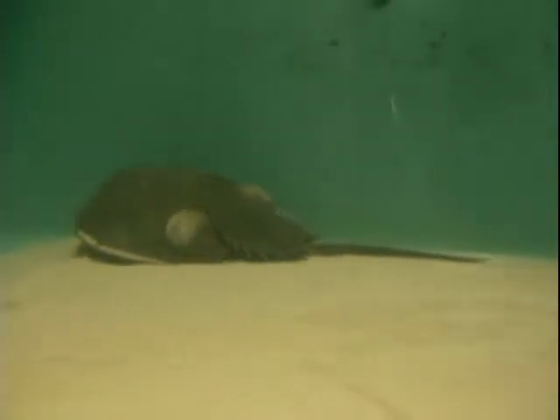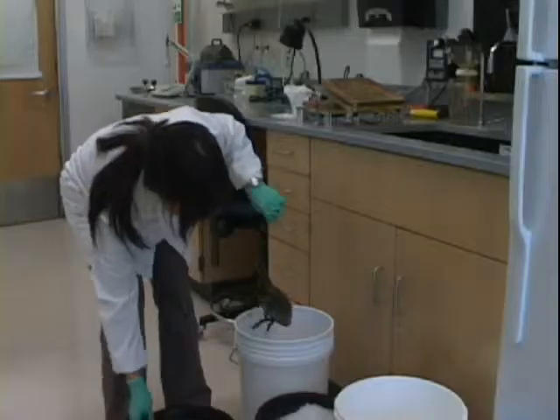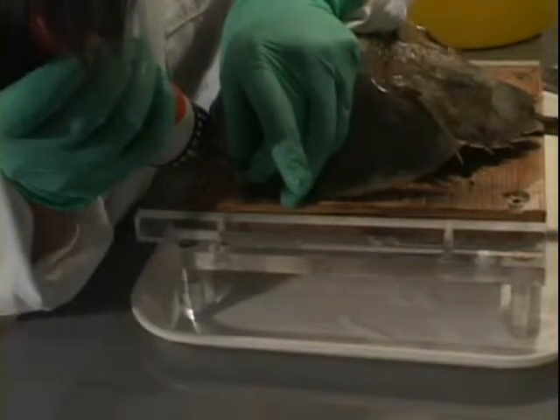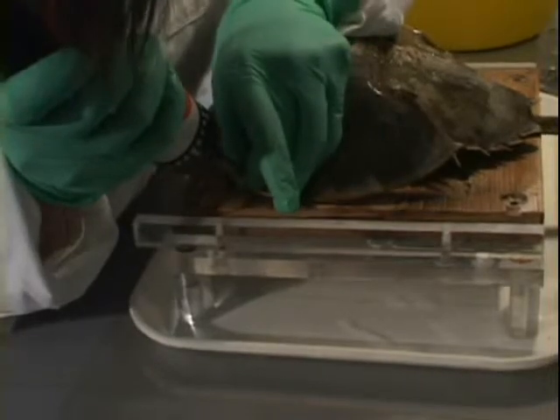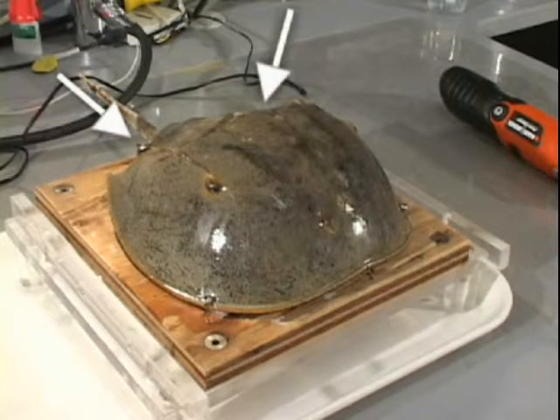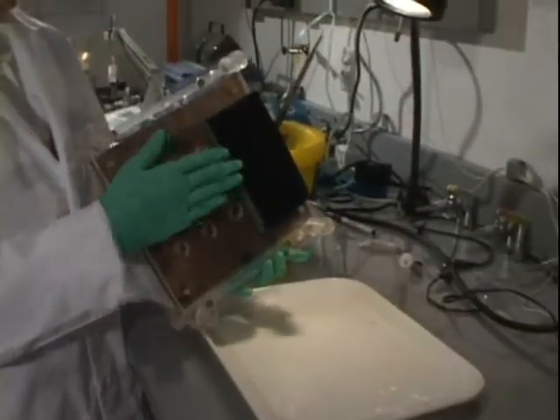The horseshoe crabs are kept in an aerated saltwater tank, in a room exposed to a regulated light-dark cycle. Before starting any of these recording techniques, the animal is chilled in an ice bucket for about 10 minutes and then secured to a wooden platform by placing two stainless steel screws in the prosoma and two in the opistosoma. The platform is weighted underneath with granite so that it sinks in water.